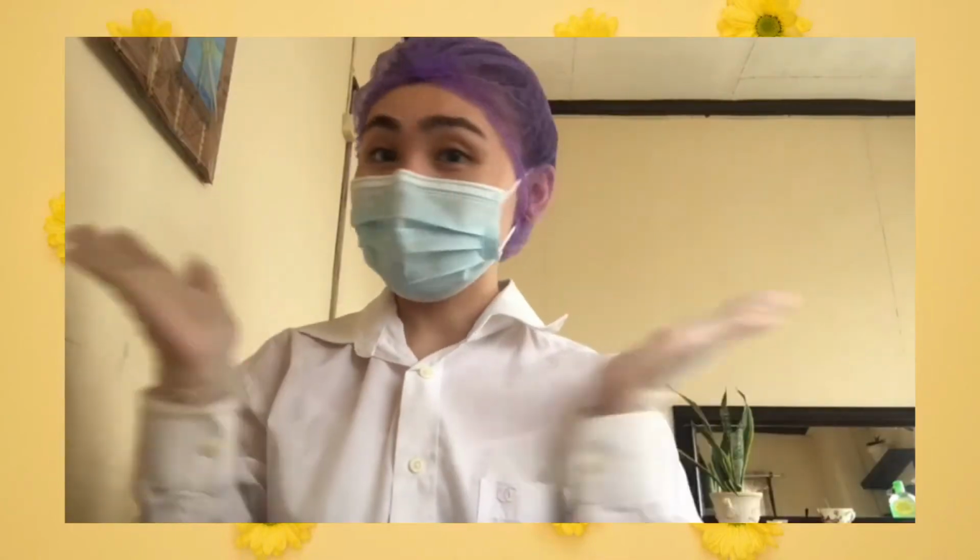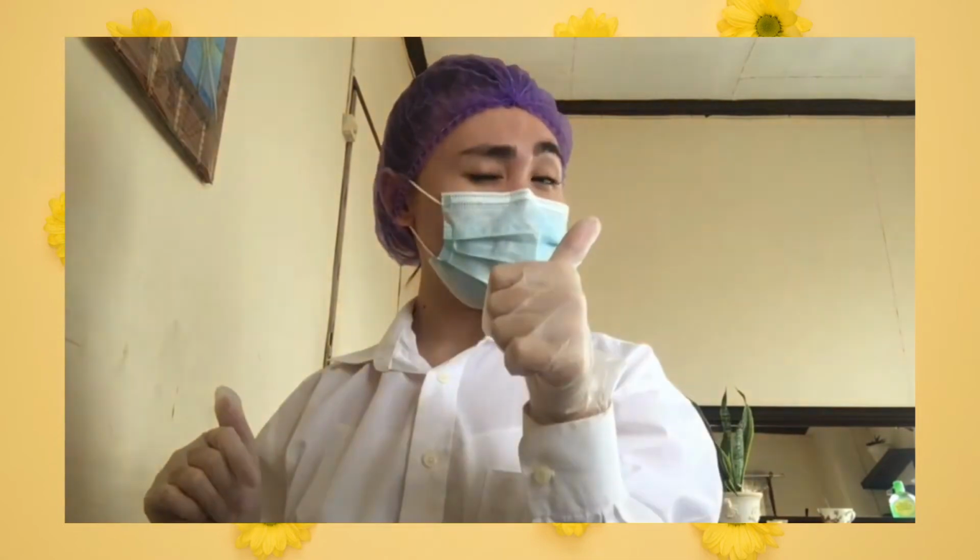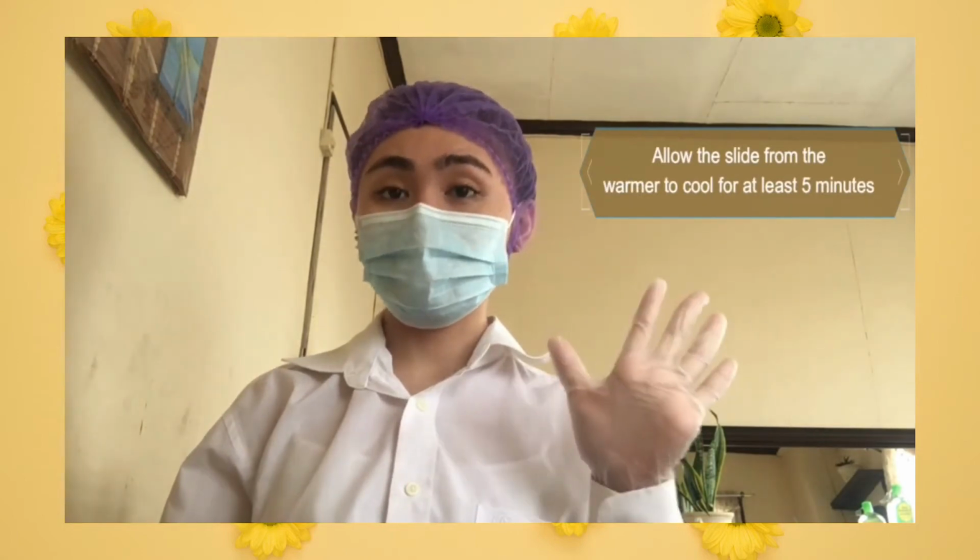Hello everyone, I am Sijumisia Presto and I will be demonstrating to you the H&E staining procedure. But before we proceed, make sure that you are wearing your complete PPEs. So without further ado, let us begin. Before proceeding to the actual staining, allow the slide from the warmer to cool for at least 5 minutes. Then, we may now begin.